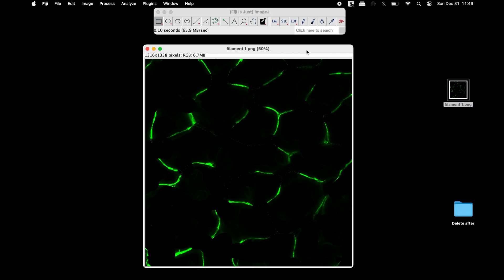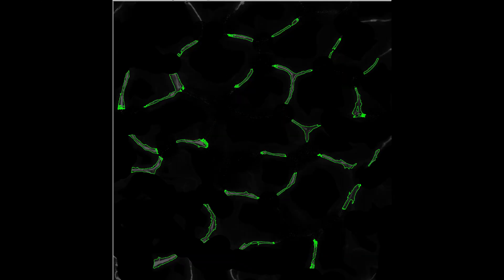To count the number of filaments and measure their areas, a macro can be used.